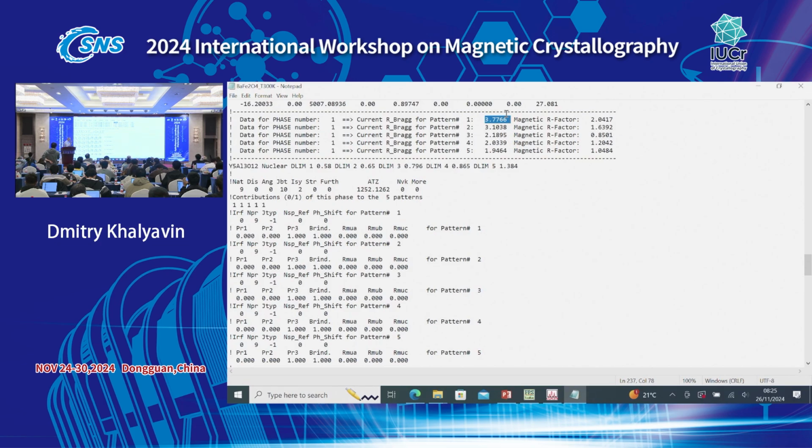If you do refinement in another space group, using the same data set, then yes, pay attention to the chi-square. Which model has a lower chi-square probably has more chance to be the correct one. But don't worry that chi-square is high. It simply tells you that your statistics are very good. On WISH, you will never get chi-square 1, never.